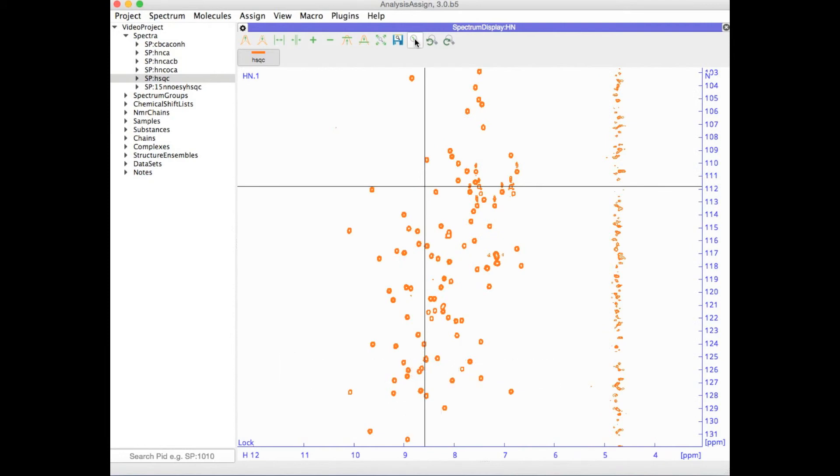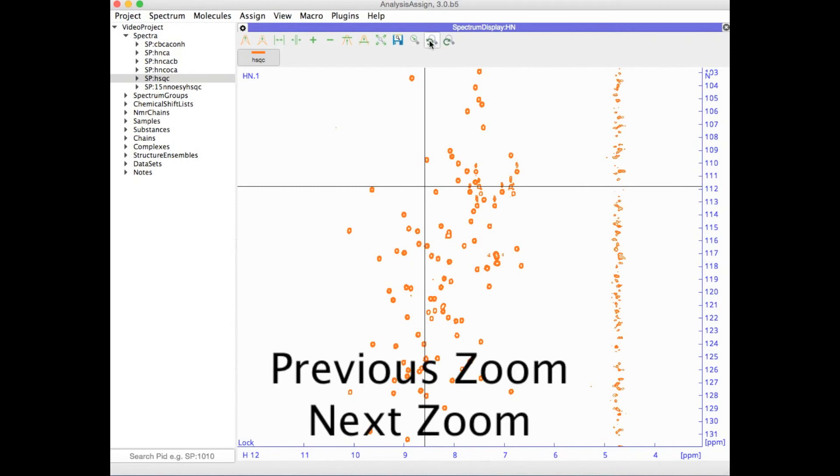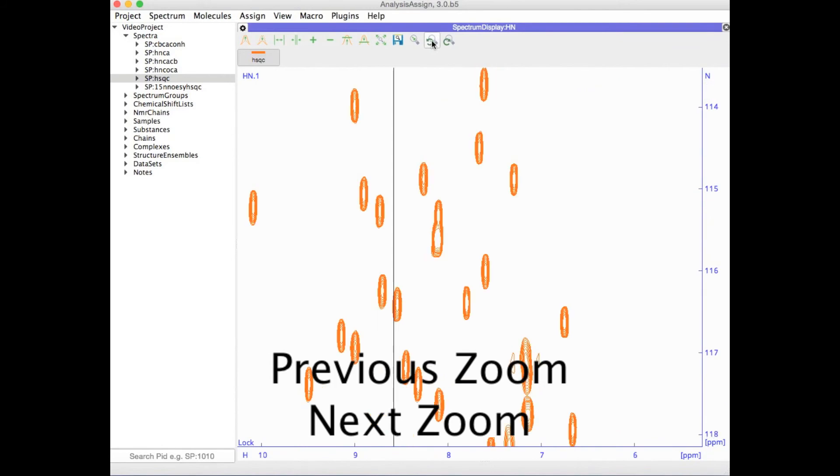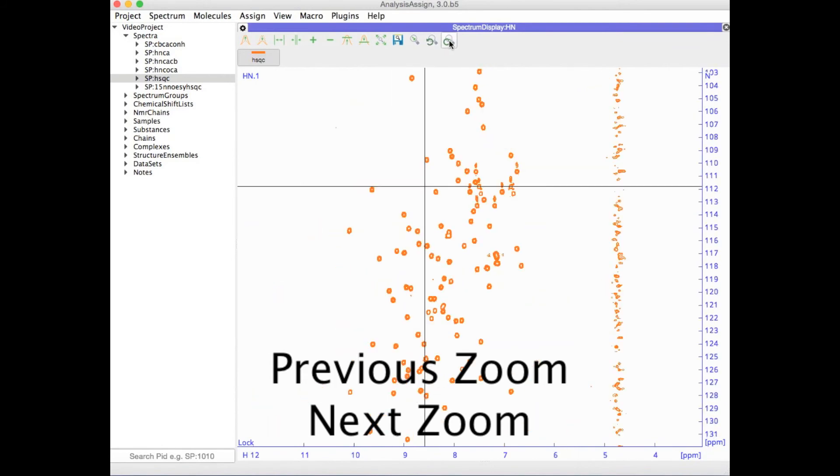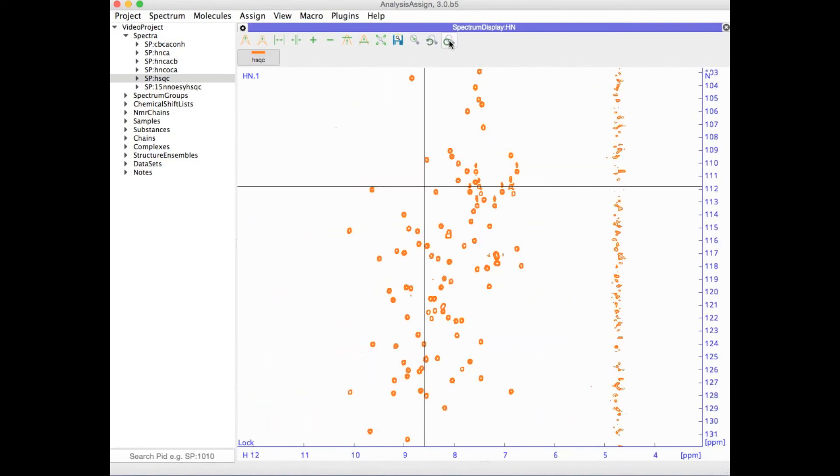You also have the option of moving through the different zoom levels that you've been using with zoom previous or zoom next. These also have keyboard shortcuts, ZP for zoom previous and ZN for zoom next.